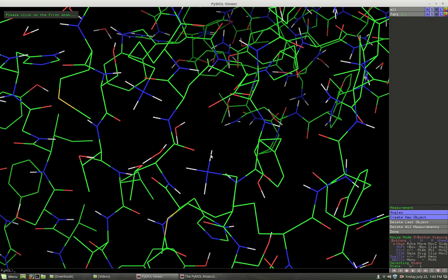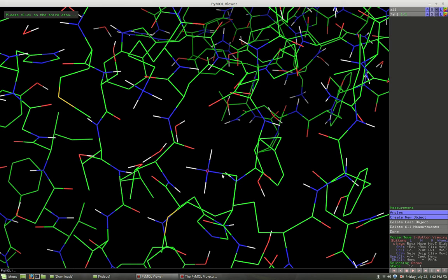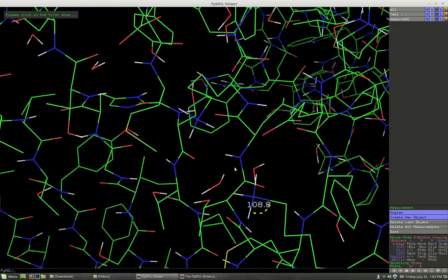Alright, and let's try this one here, here, and here. Oops, that didn't work. Here, here. I guess I do have to go down here. 109.6. All right, let's clear that again. Let's go here, here, here, and that's 108.8. Not quite even. All right, so very interesting.